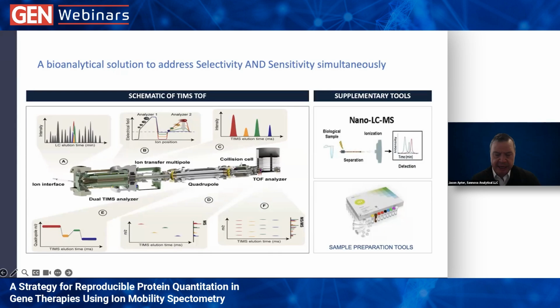That makes sense. It's kind of like any technology evolution. It's the intersection of a number of different technologies. We talk about the ion trap, we talk about ion mobility spectrometry, we talk about the TOF analyzer, and then you add on things like the ability now to do nano LC, and even what we didn't touch on is some of the advances with sample preparation tools that a lot of the tools companies now are working on for mass spec specific tools.